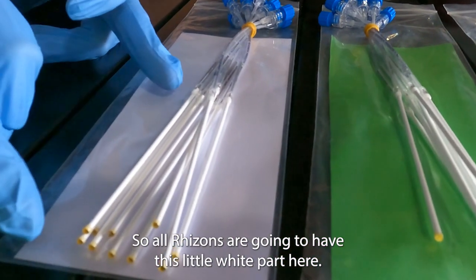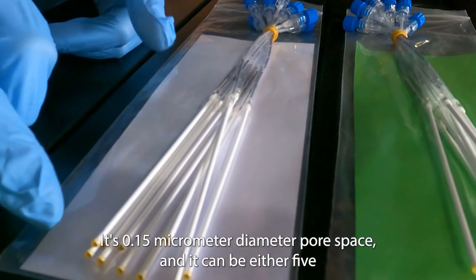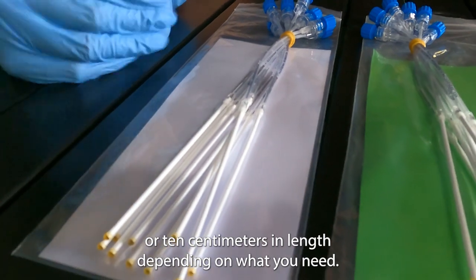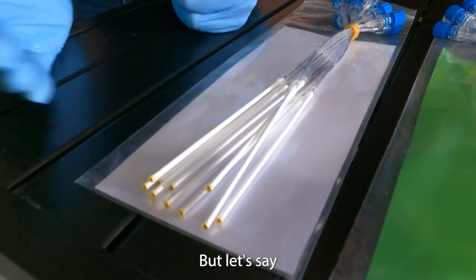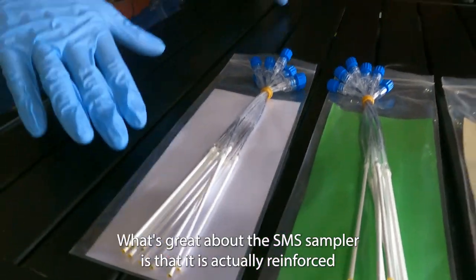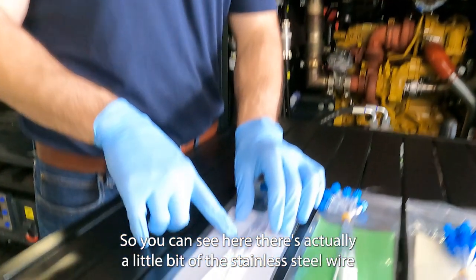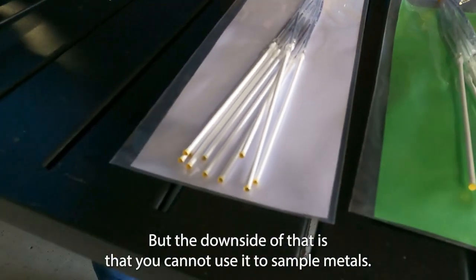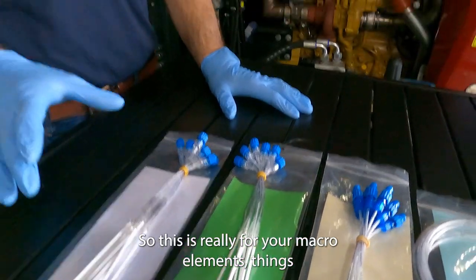All rhizons are going to have this little white part here — this is a porous sample rod effectively. It's 0.15 micrometer diameter pore space and it can be either 5 or 10 centimeters in length depending on what you need. The longer ones let you get more volume quickly, but for a small pot or chamber you'll need the 5 centimeter. What's great about the SMS samplers is that they are reinforced with stainless steel wire, which makes them pretty robust, but the downside is that you cannot use them to sample metals — so this is really for your macro elements.